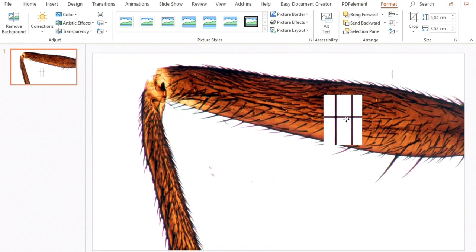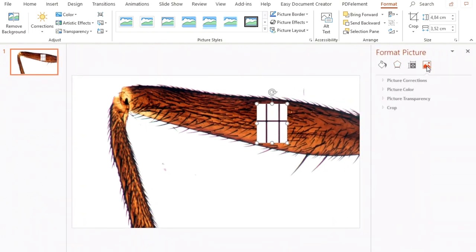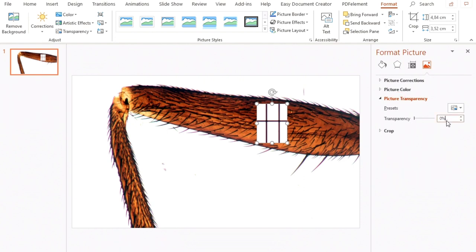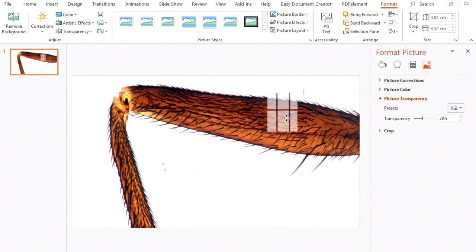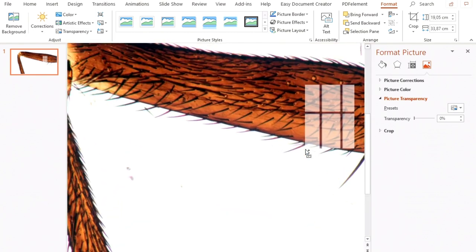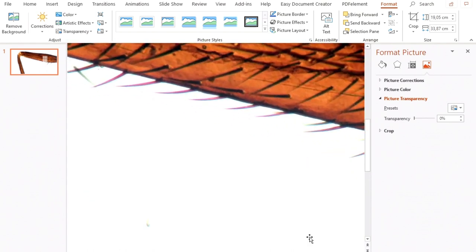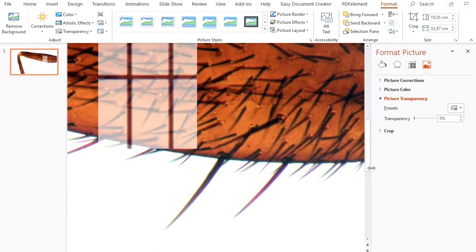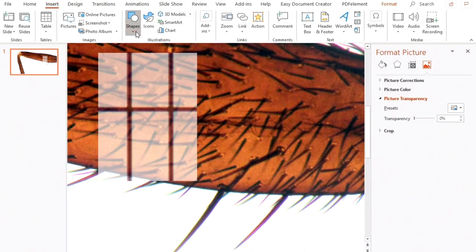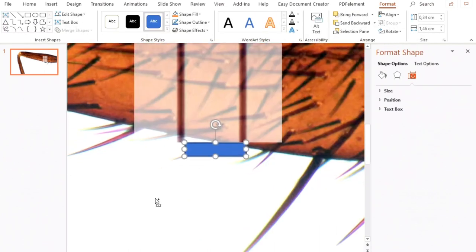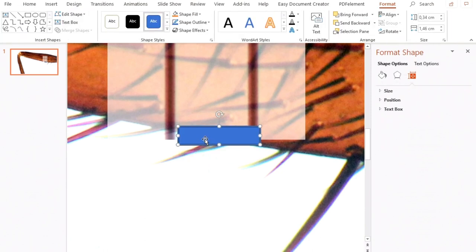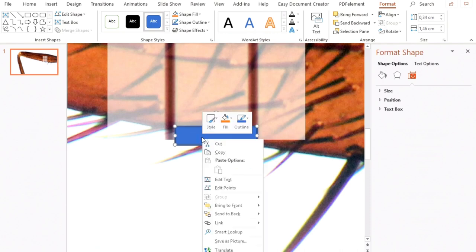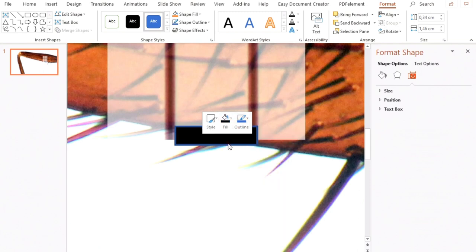So now I have basically everything in scale and I'm going to do now the following. I'm going to click format picture and I want to change the transparency around. You don't have to do that, but it makes it easier to simply superimpose the scale. And you can move it around and you can make direct measurements this way. And I think that's kind of convenient. But what I want to do is I want to make a scale bar. And for making a scale bar, I'm first again going to zoom in a little bit because otherwise it's too small. And then I'm going to draw again a little box just like I've done before in Photoshop. Click shape. In this case, I'm not selecting it, but I'm simply drawing a box. And in this case, I'm now using the right edge of the line each. And that is now 0.1 millimeters again, so now from right edge to right edge of the line.